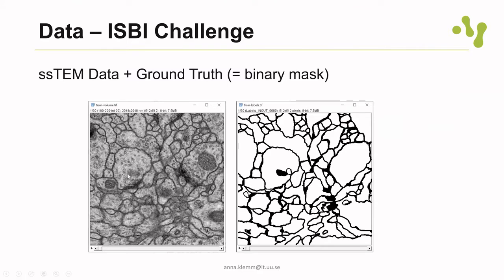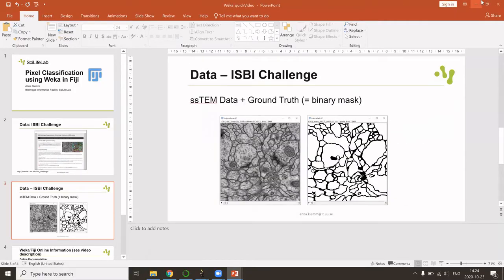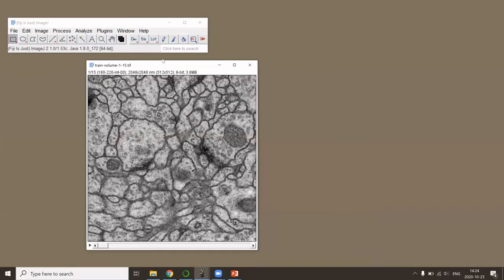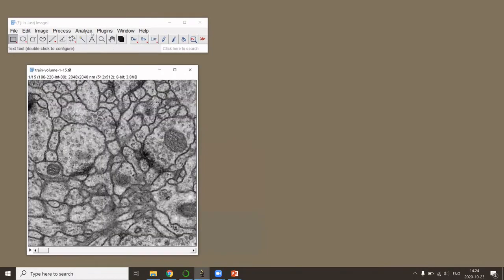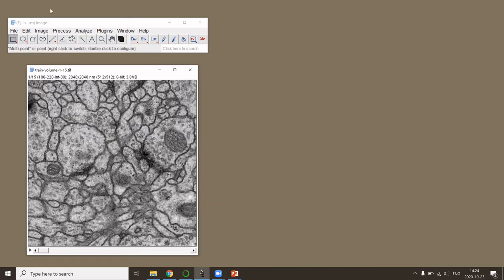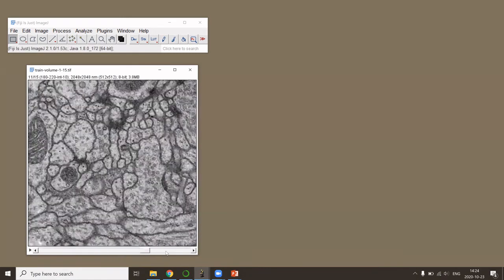To do this, what I did was to open a part of this dataset in Fiji. As you can see, this is a 3D stack.